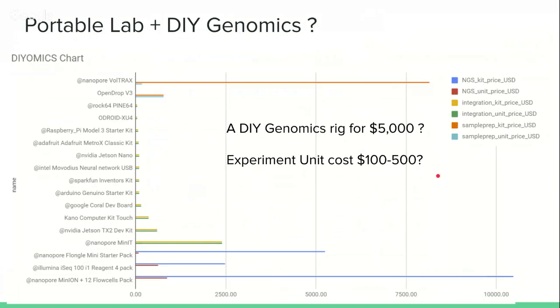And so I don't have an answer to these questions. I can put some of the pieces of the puzzle together, but I'm starting to see this puzzle being more and more complete. And this paper about the portable lab is an example of people thinking along those lines. What's the minimum that you need, in this case, to make it portable, but also small and minimal to do some genomics, right? And that's why I wanted to make this connection.